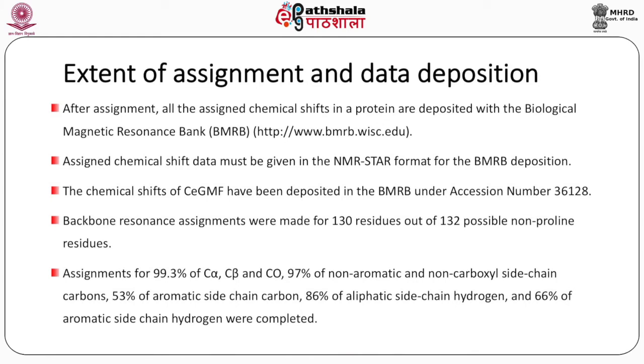Assignments for 99.3% of C alpha, C beta and carbonyls, 97% of non-aromatic and non-carboxyl side chain carbons, 53% of aromatic side chain carbons, and 86% of aliphatic side chain hydrogens and 66% of aromatic side chain hydrogens were completed.